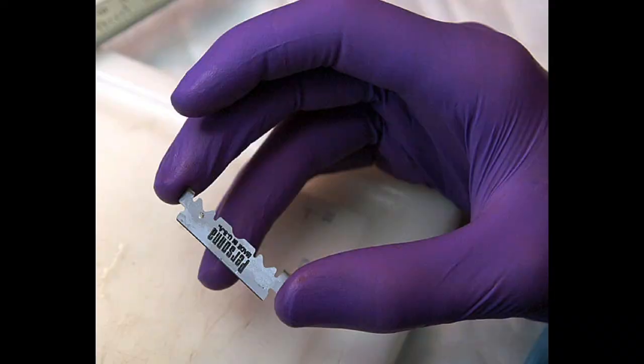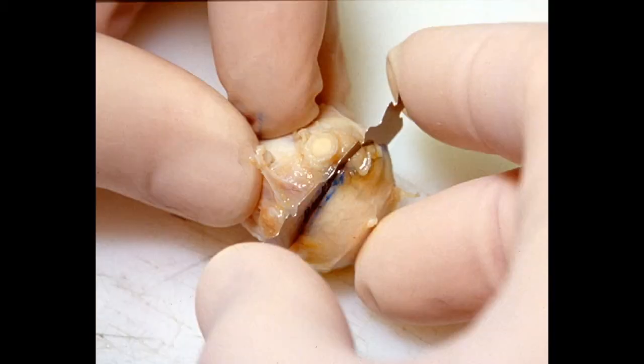In our lab, we cut eyes using half of a double-edged razor blade which is snapped in two. During sectioning, the globe is oriented cornea side down to avoid dislocating the lens, and the cut is started posteriorly near the sheath of the optic nerve. A gentle sawing motion is employed as the cut is extended anteriorly.